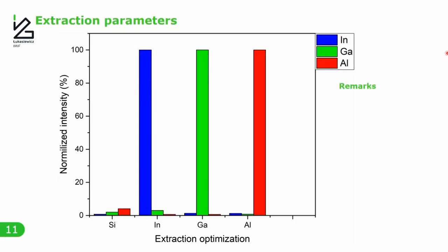There is one problem, however: currently the software does not support this change of the extraction parameter during the analysis. So to solve it, I simply had to program it as a chain analysis. So the software is interpreting it as if I'm making a series of separate experiments when I'm switching these extraction parameters. The little problem is that I get one data point per file for creating a full depth profile, and I can end up with like 20 or 50,000 files. So trust me, you need a script to compile it again after the analysis.